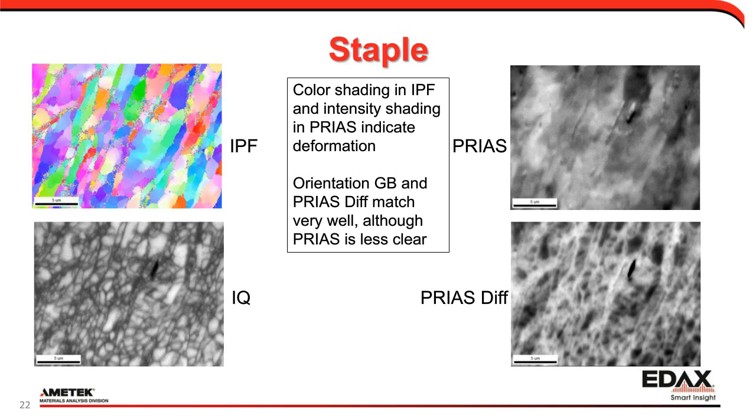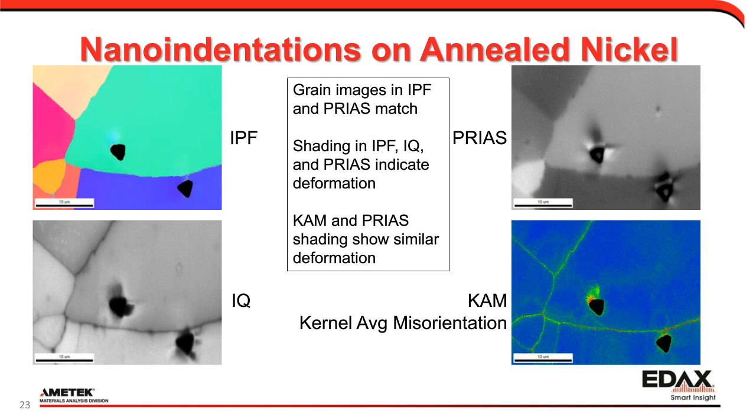In this annealed sample, we expect minimal contrast within the grains and highly concentrated contrast near the indentations from the deformation.